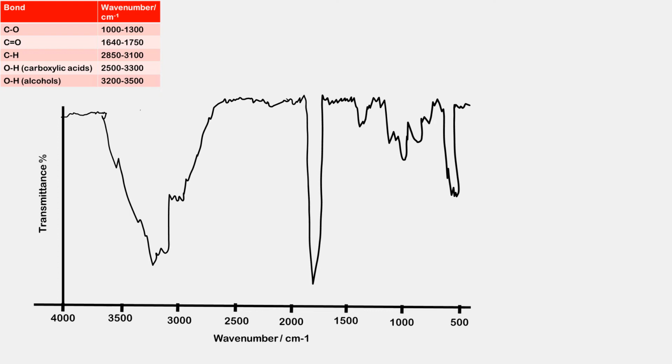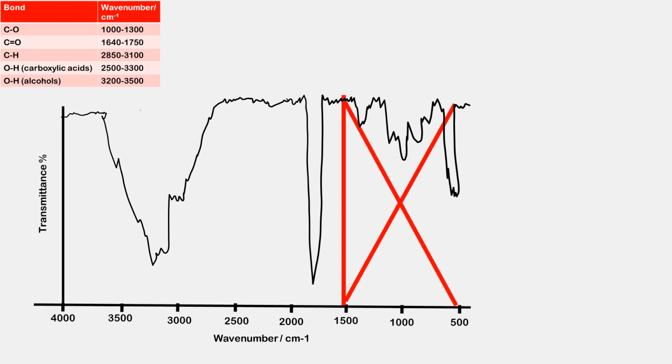Last one, join in if you know the lyrics by now. Ignore the fingerprint region. Find your CH peak. It's normally there as its schedule, like mine, is pretty bare and it literally has nothing else to do but show up in spectra.